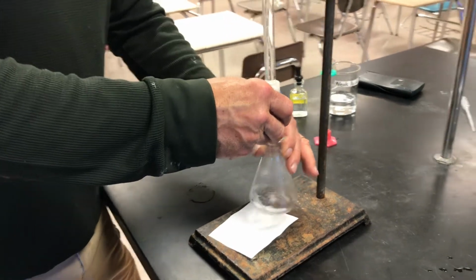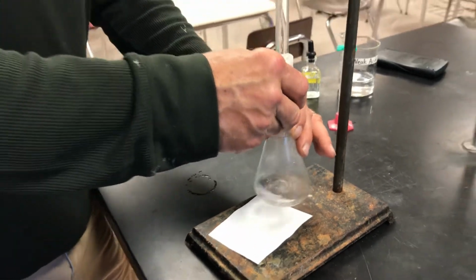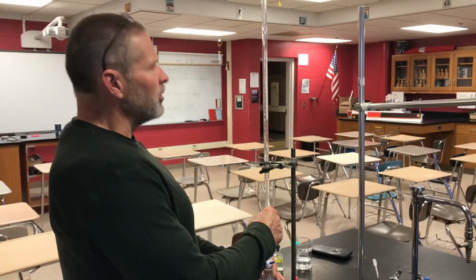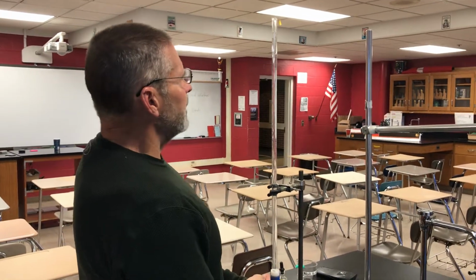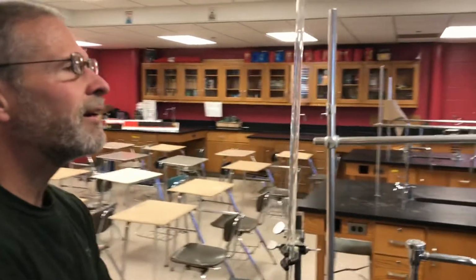Okay, so we had already run one fast and sloppy trial here. And what did we say, Mr. Moore? We used about 6 milliliters or something? Well, it was about 7, so we thought around 6 we should slow down. Okay, I'm having trouble seeing the graduation on this burette.